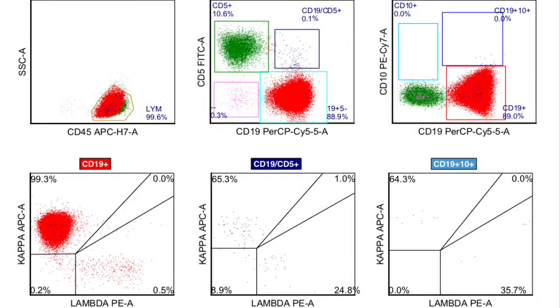This shows the basic flow panel that was run. The top left-hand panel, CD45 by side scatter, shows a fairly homogeneous population of lymphocytes. Moving to the right on the top row, you can see we have colored the B-cells detected by CD19 in red and the T-cells CD5 in green. There is a significant shift towards B-cells, with about 90% of the lymphocytes being CD19-positive B-cells and about 10% being CD5-positive T-cells.